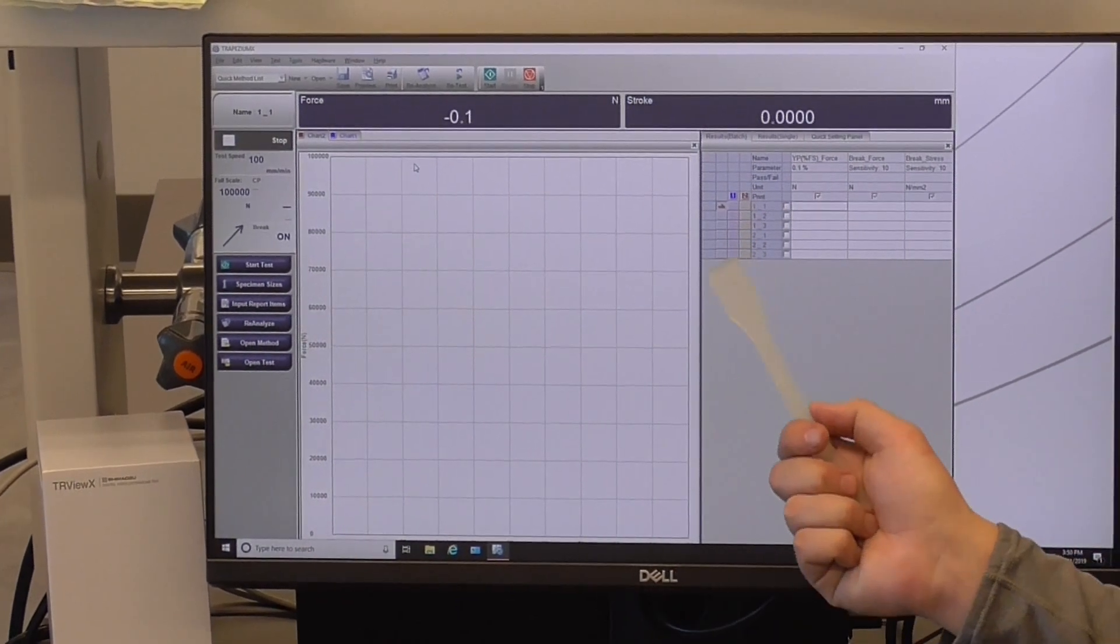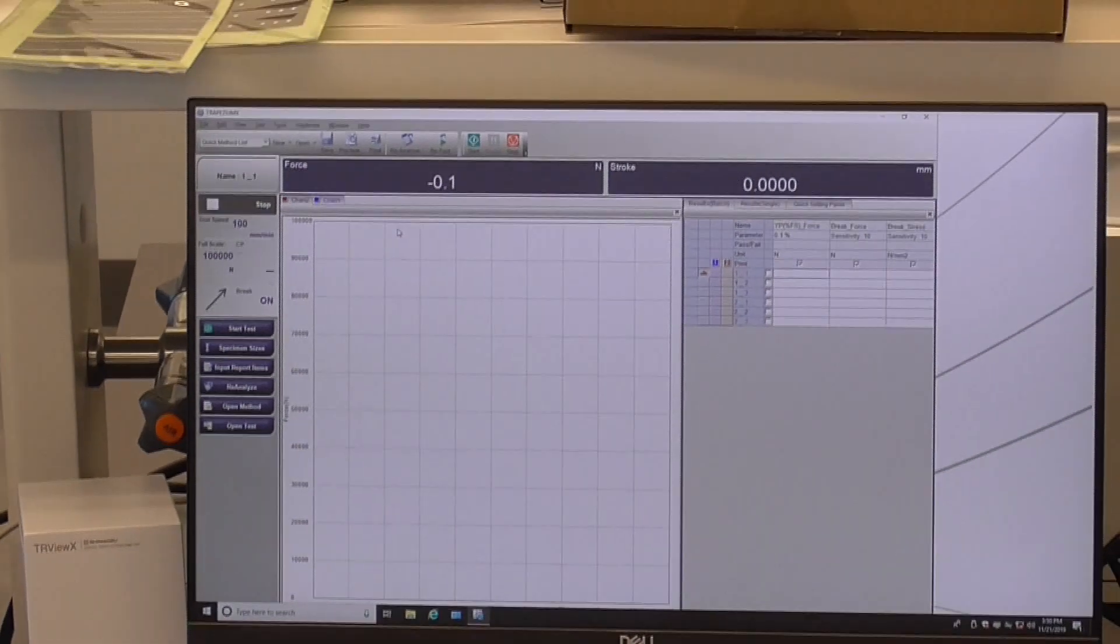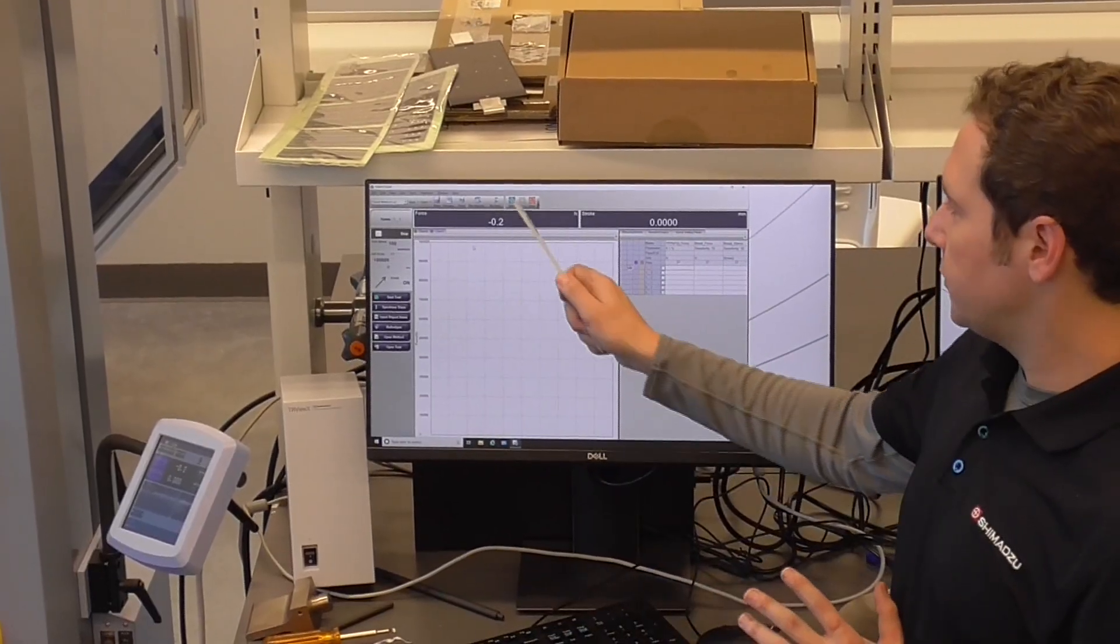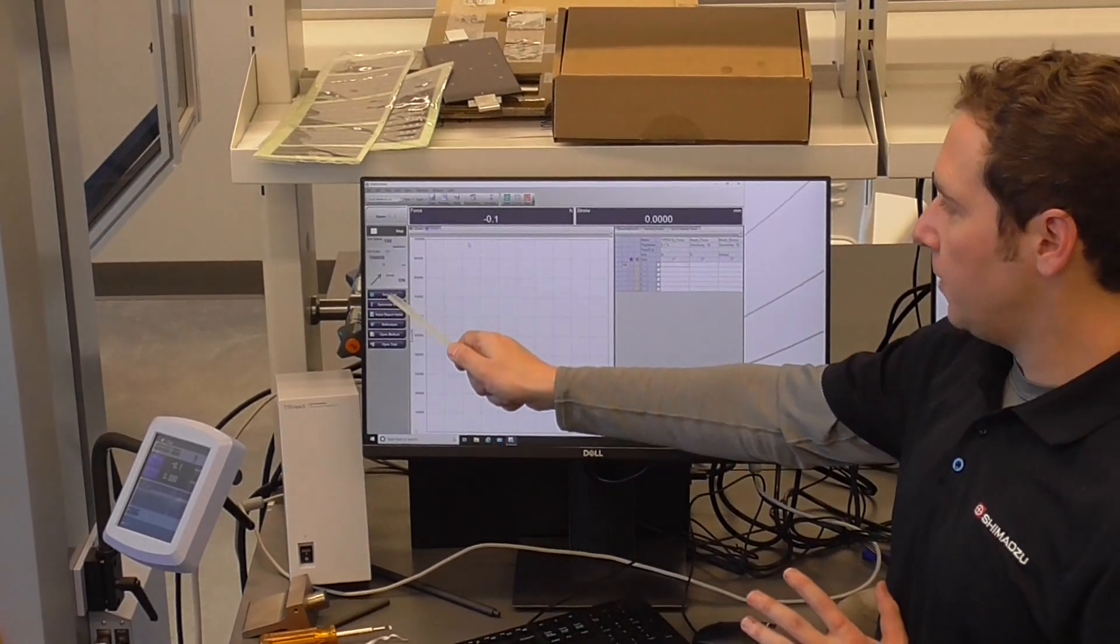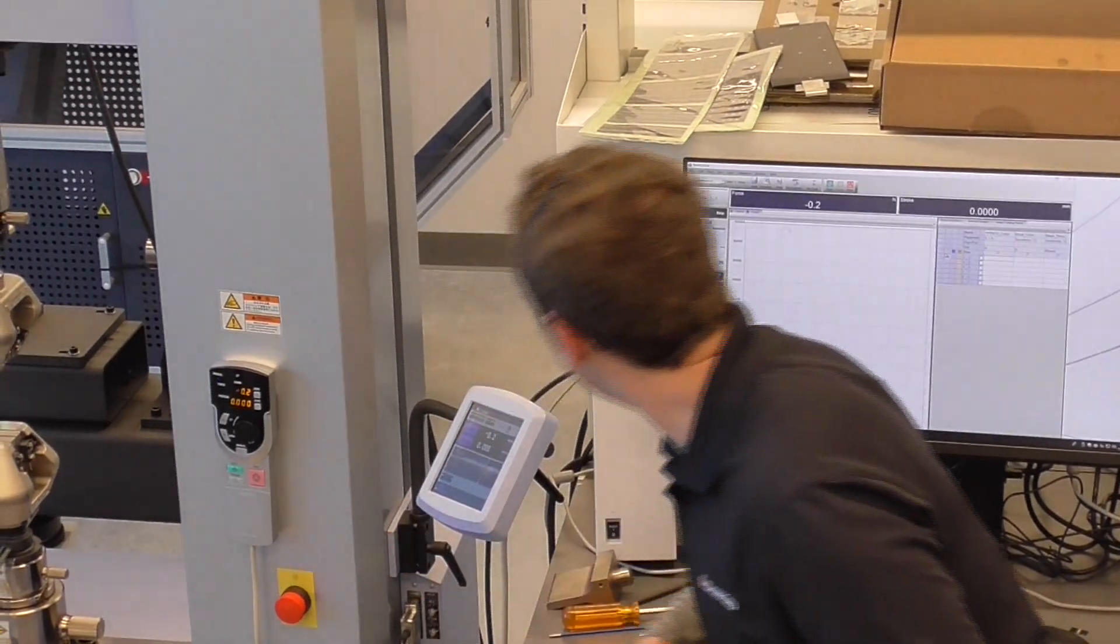Something else to note about this menu is that there's a few different ways to do just one thing. Which is kind of confusing. But the reason why they set it up that way is for different workflows. So, for instance, you have a start button right here. You also have a start button right here. You can start it in the frame as well. And you can start it from here as well.